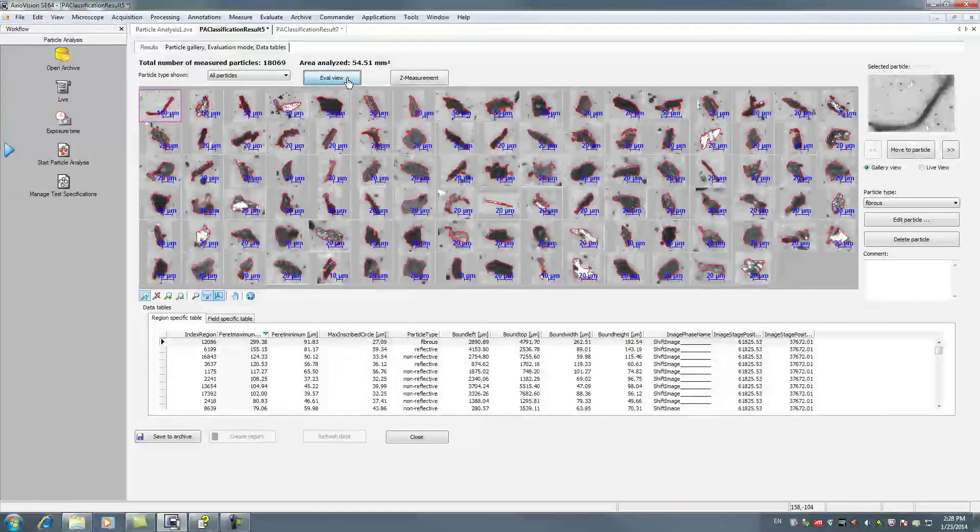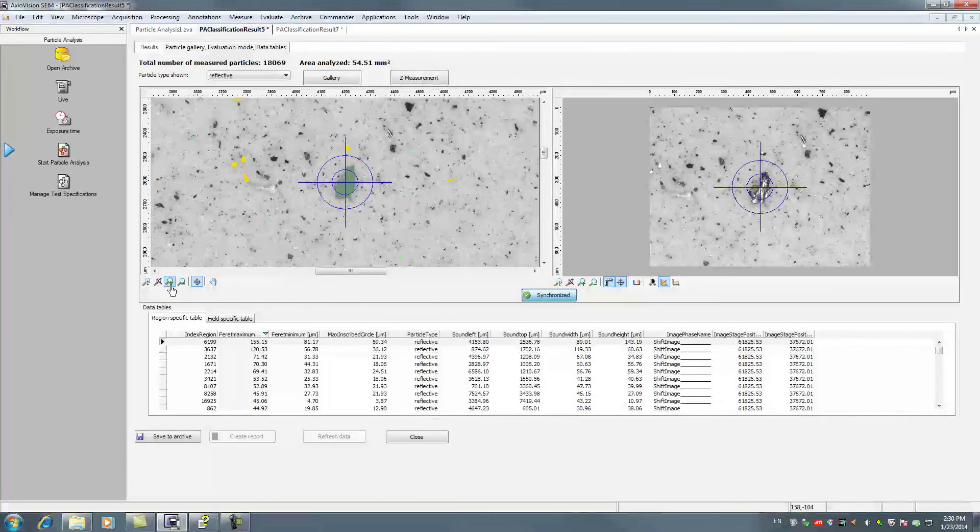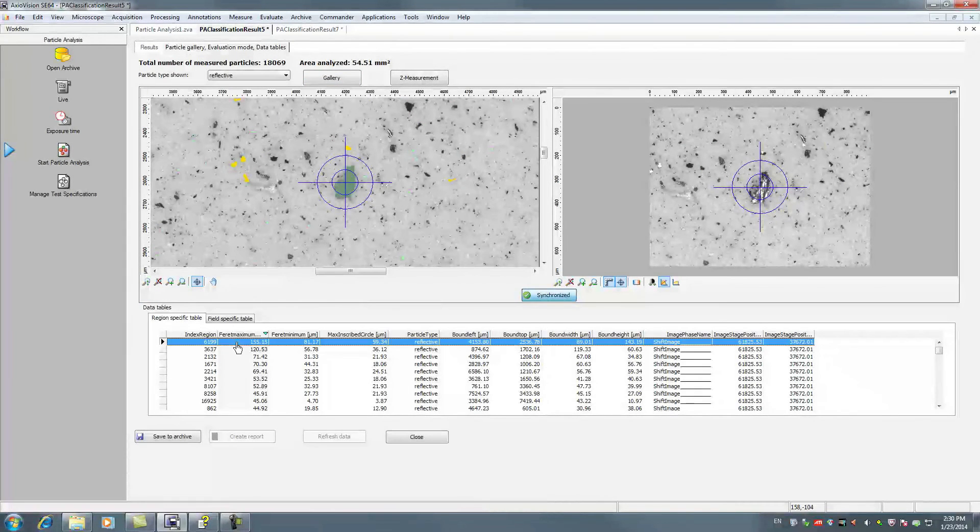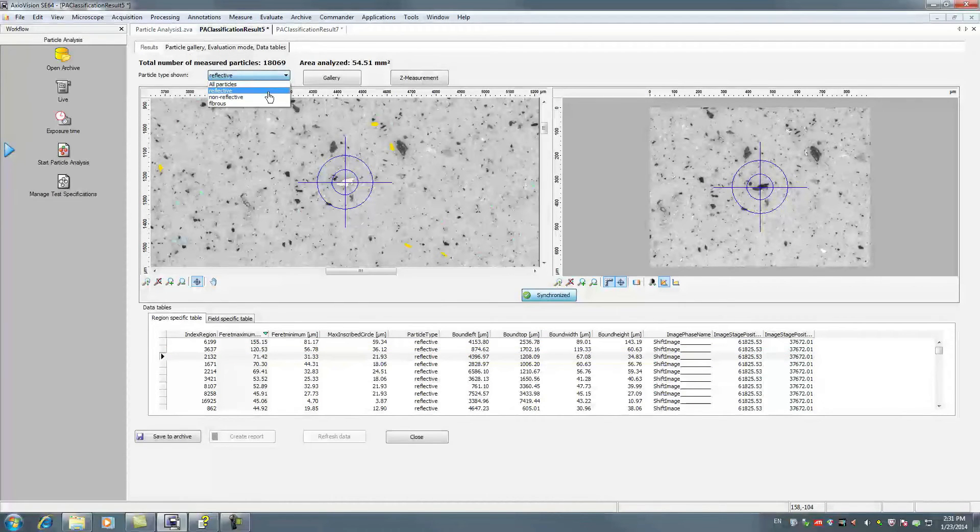At the touch of a button, relocate particles using the data tables, the images in the gallery view or the particle map in the evaluation view.